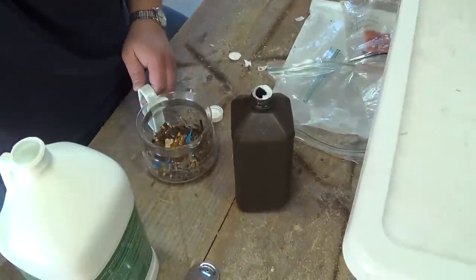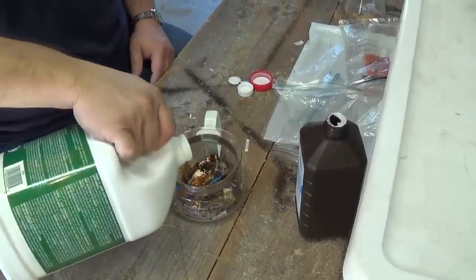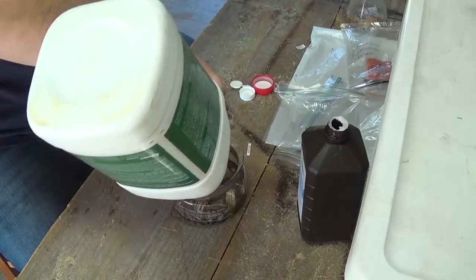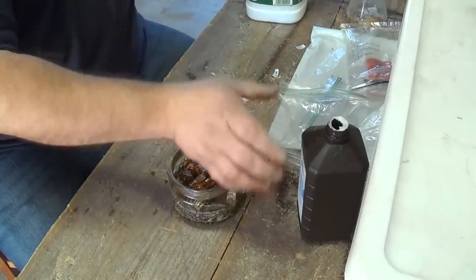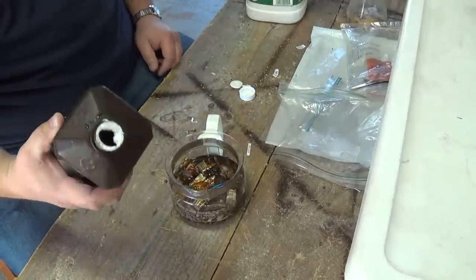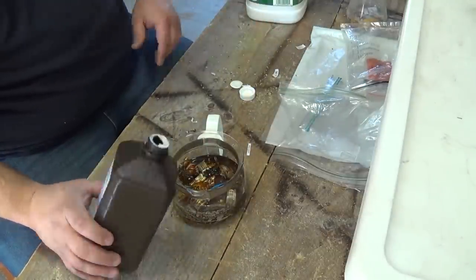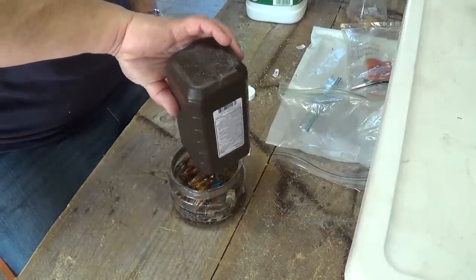So we're going to do this the same way that we process anything else in AP. I've got a little glass coffee pot. What I'm going to do is I'm going to add some HCL, just enough to cover it, which happens to be the last of my jug. And then we're going to add peroxide. Now you're supposed to add the peroxide first. You're supposed to add acid to water, not the other way around, just in case it splashes back. But because this is such a small amount, I'm not going to fuss on it.